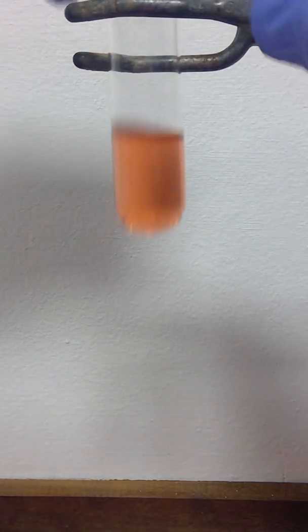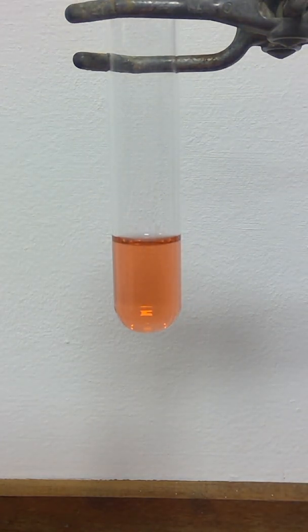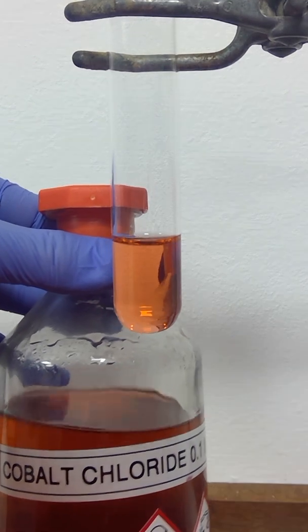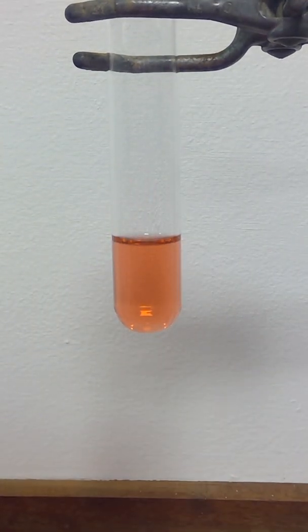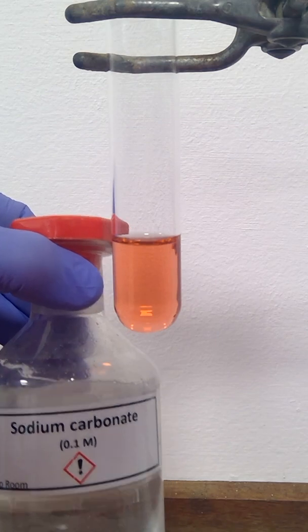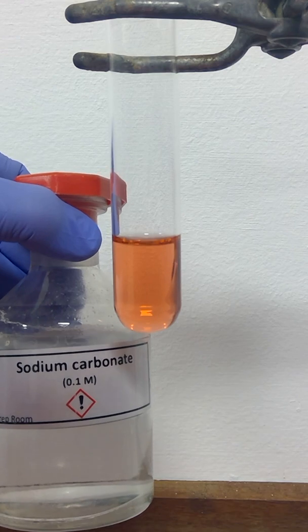In the third example, we'll make a carbonate. The solution taken this time is cobalt 2 chloride, which is this pinky red colour. The cobalt 2 chloride has been made up by dissolving, once again, a pink coloured solid into water. I'm going to add to this a few drops of sodium carbonate solution, which again has been made up by dissolving a white solid into water, and it makes a colourless solution.